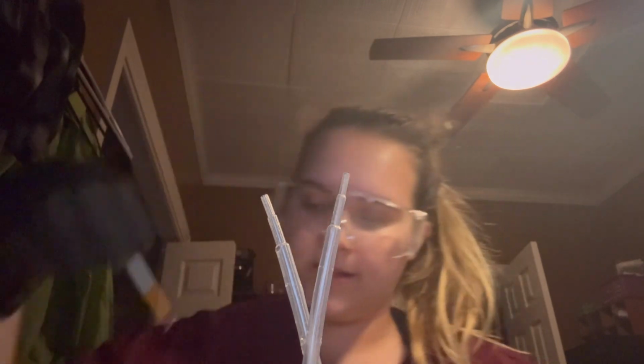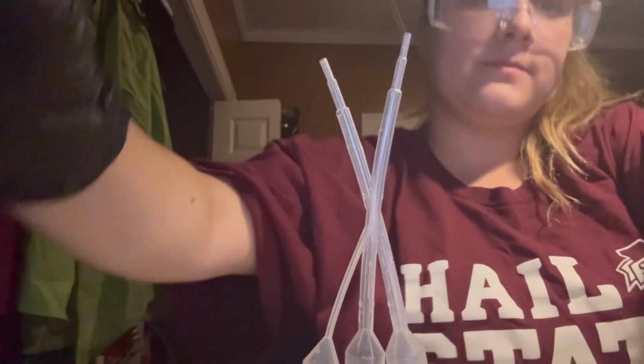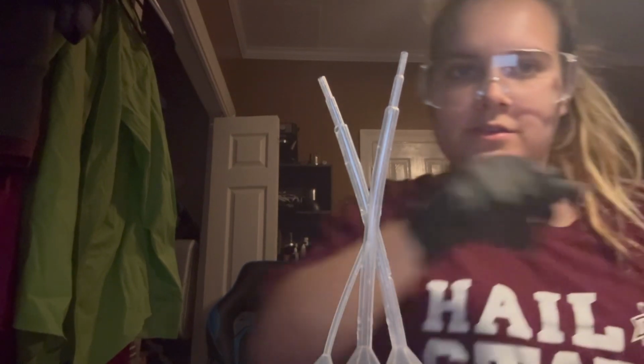So it looks like this. It looks to be super acidic. Well, I would probably put it at 1, since the bottom part doesn't look that purple. So I'll put the pH of this as a 1 for 4 drops of HCl. And I'll show you guys the results for data table 3.